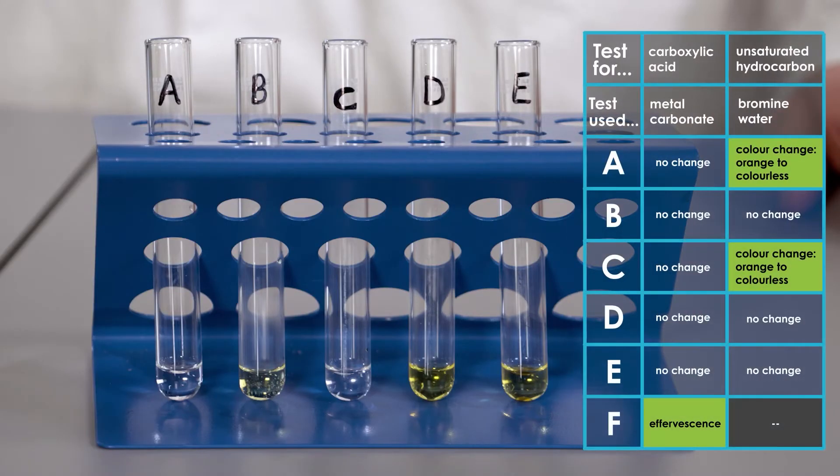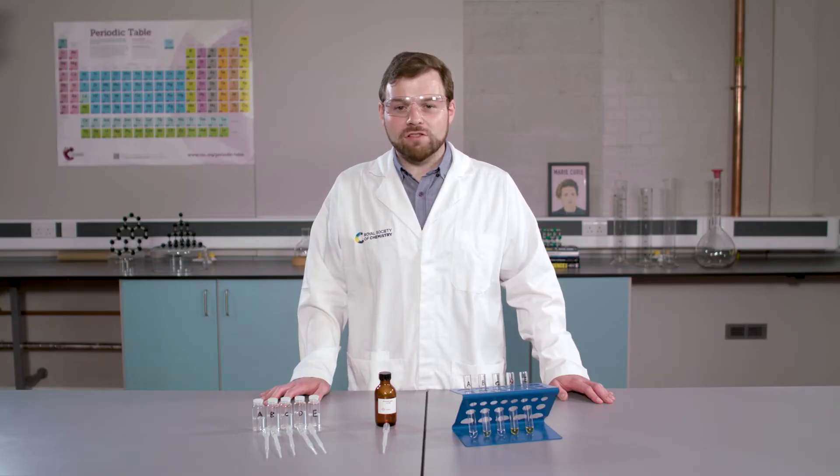You can see we have a positive result for samples A and C. You might be surprised by that result if you are expecting one positive result confirming the presence of the double bond. At this stage, I can't identify the unsaturated hydrocarbon, as clearly other functional groups also give a positive result. This shows the importance of completing the tests on all of the unidentified samples. When carrying out an investigation like this, you may get unexpected results, meaning you need to go back and adapt your original plan. Be prepared to be flexible.